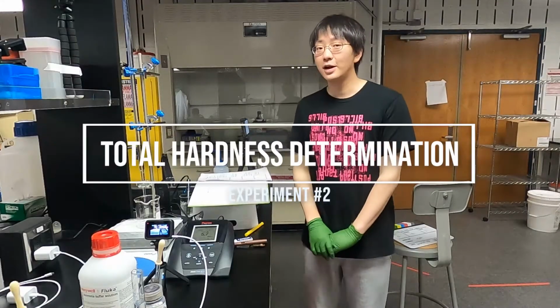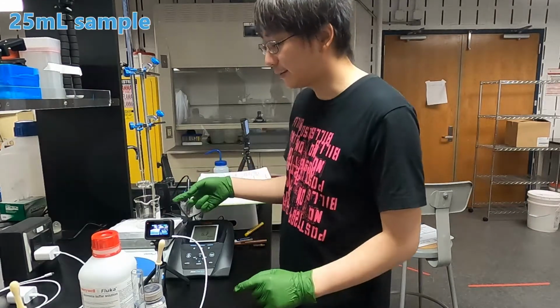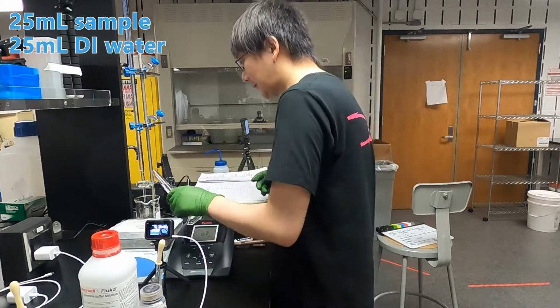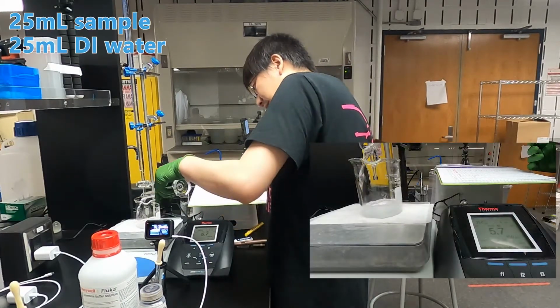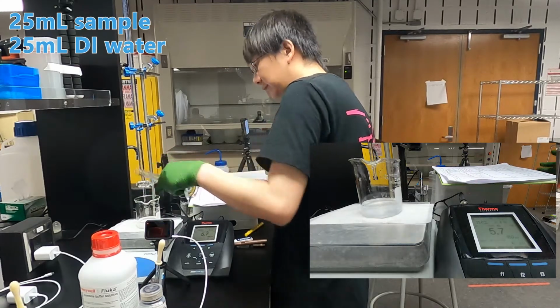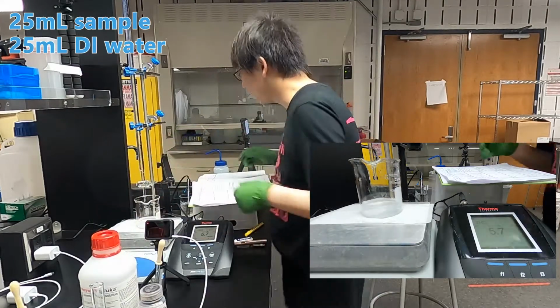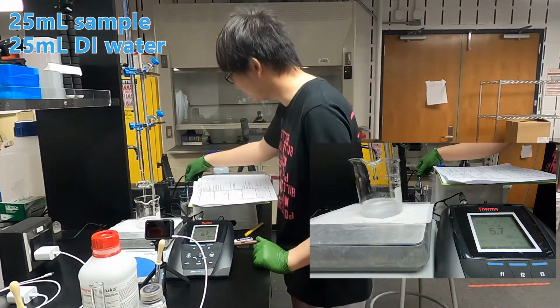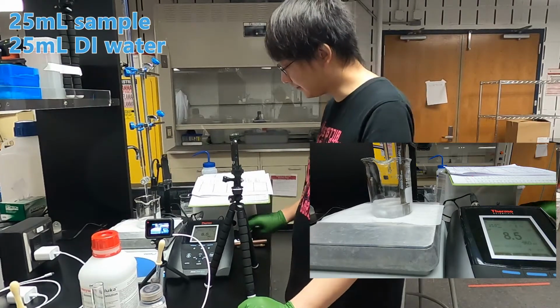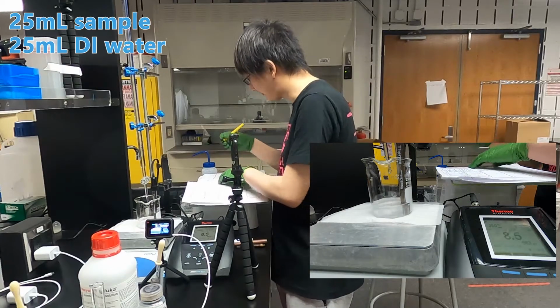So now we are going to measure the total hardness. So here is our sample. First we add 25 ml of DI water into the solution. And then we measure the pH of this solution. We can see that the pH is also very basic, and then we write down this pH.